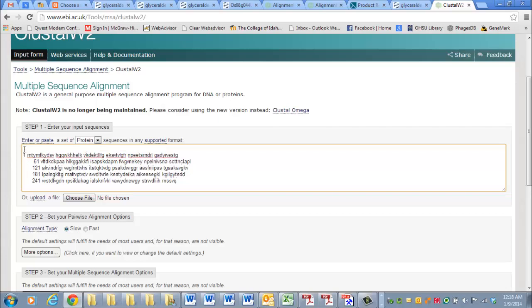You have to add a little set of characters up here. The inequality sign followed by some text, and we could say GapDH Tomato. That makes it recognizable to Clustal W2.